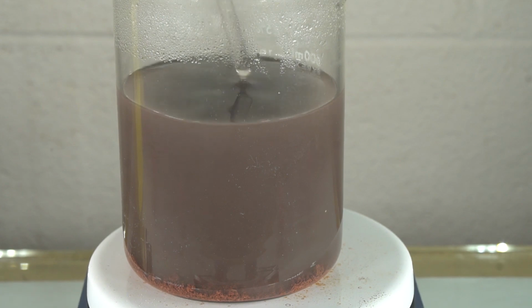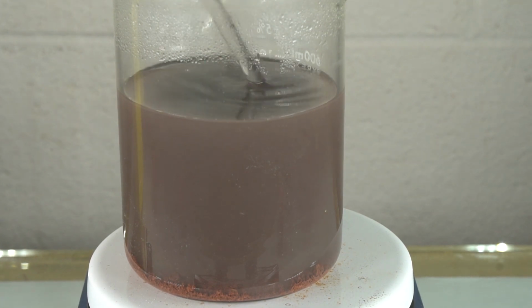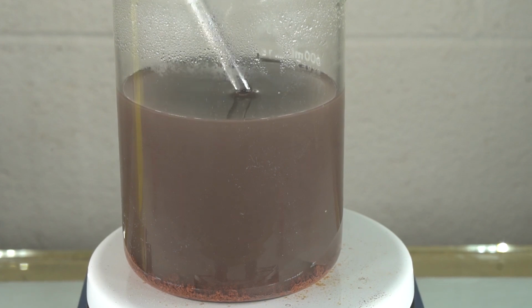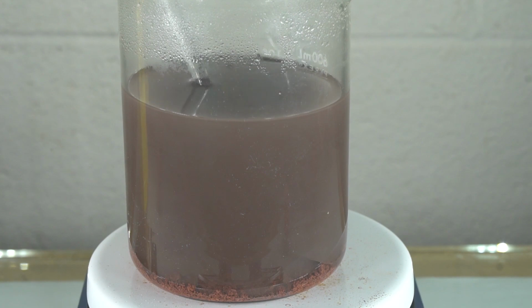Now, just to be sure, what I did was I put in a small piece of aluminum foil, and I'm looking to see if it has any copper forming on it. I'll dig that out in a minute, but I did not see any copper on that. So that makes me think that not only did this go to completion from the aluminum point of view, but also from the copper point of view. And yeah, it's still pretty hot, but it's going to cool down. So I'm going to let this cool down a little bit more, and then we can filter our copper metal and talk about what kind of yield we're expecting.